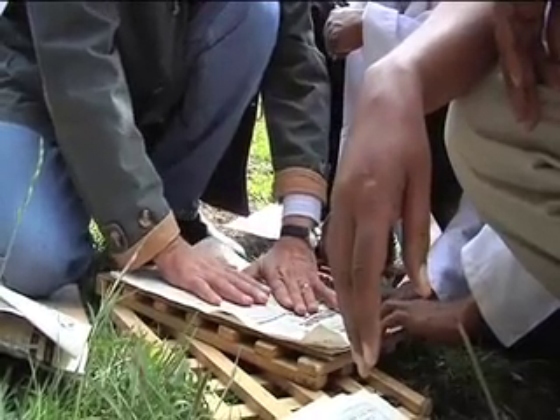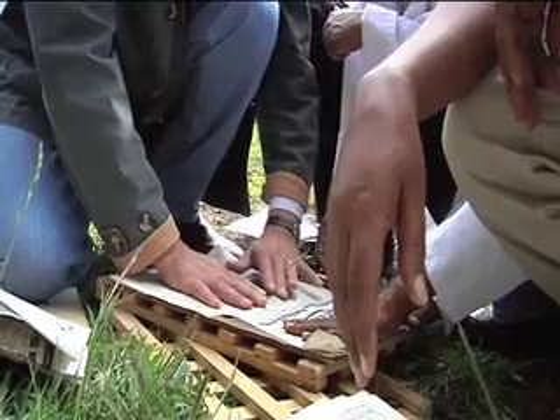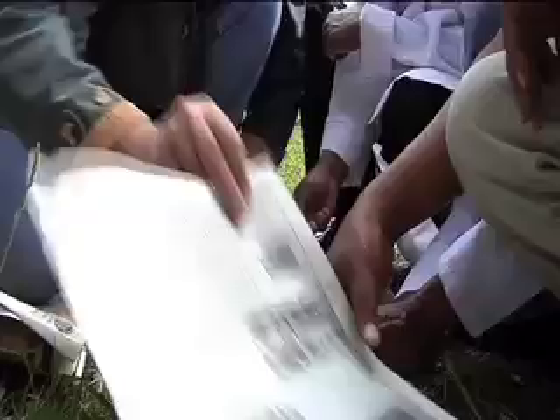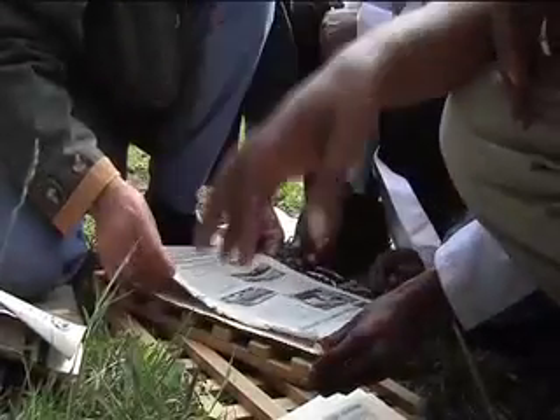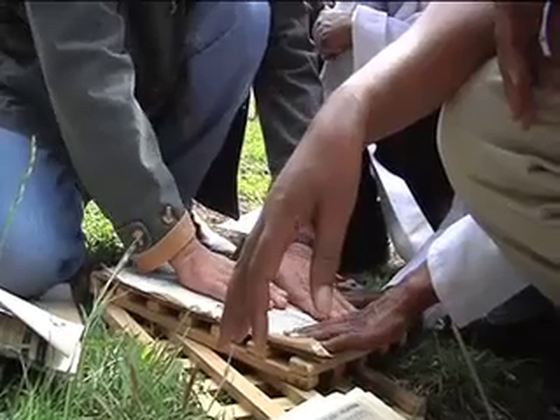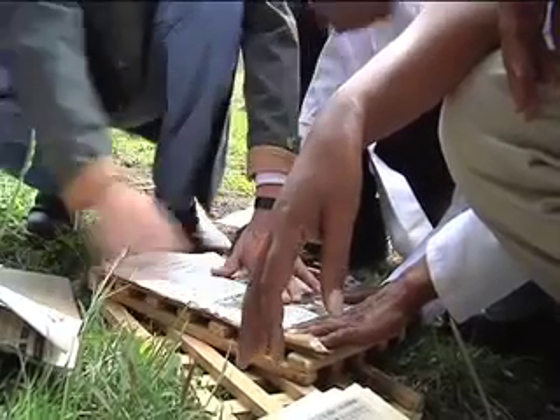Once dry, the specimen should be sent for storage in the Herbarium. We can put an additional one in just to make sure that we have everything ready for the next step.